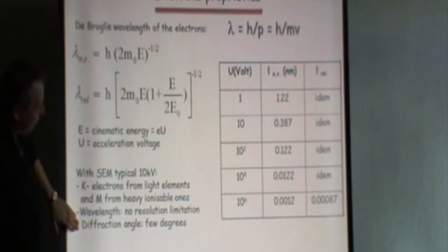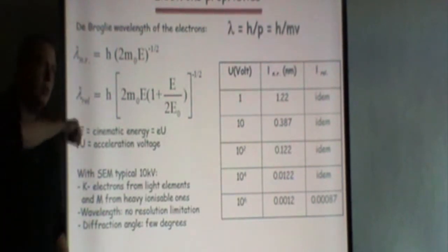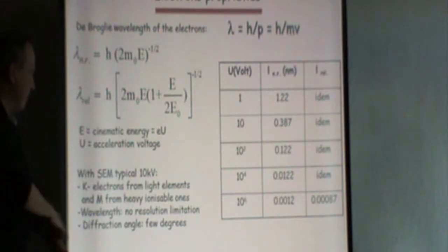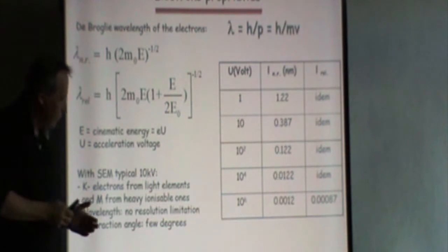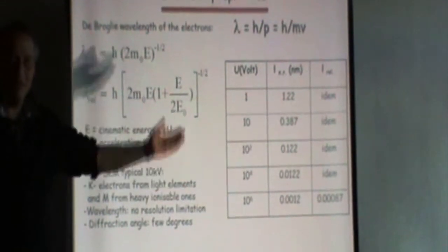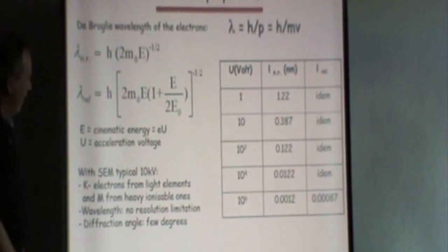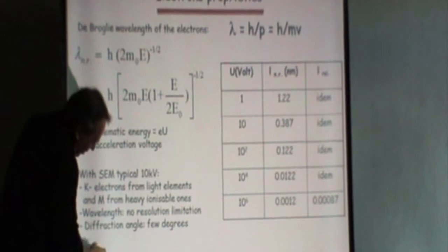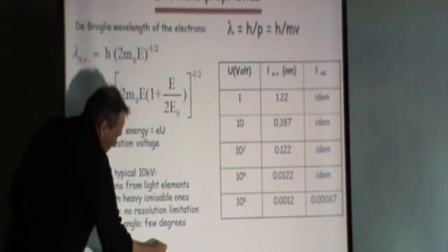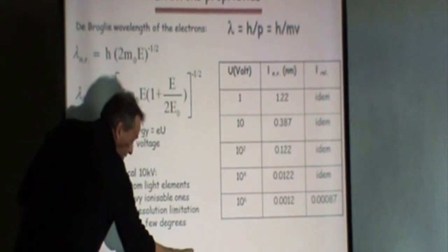Another thing is, if we talk later about diffraction, I don't know if you've heard about X-ray diffraction, there is a Bragg equation: 2 times the lattice distance times the sine of the Bragg angle is n times lambda. If you think about this equation, if you have seen an X-ray diffractometer, right? Keith, who just arrived, one of our ESRs, does a lot of X-ray diffraction, right? So the diffraction angles are 40, 50, 60 degrees, something like that. However, it's 2 times the lattice distance times the sine of the angle equals n times the wavelength. And if you want to study this, the angle has to be very small if the wavelength is very small.